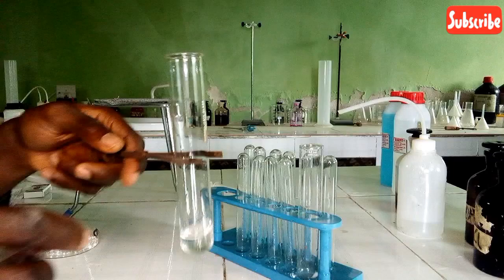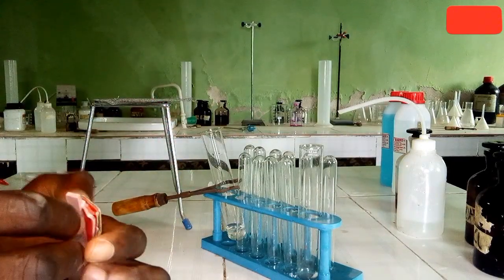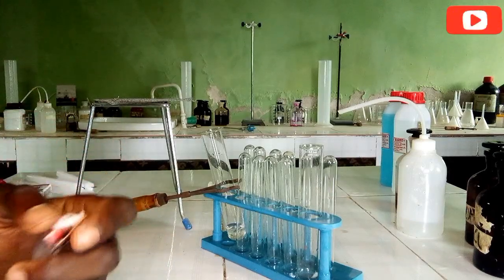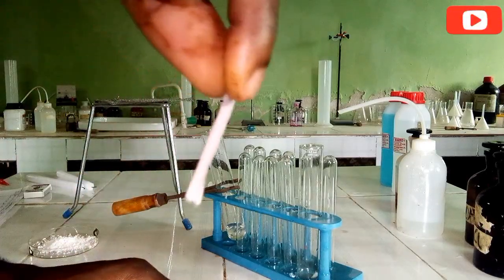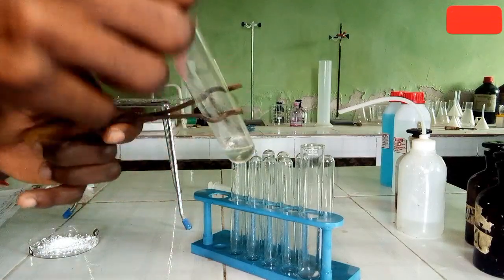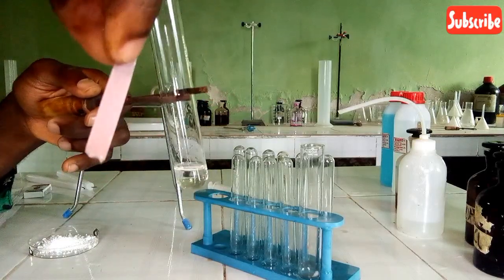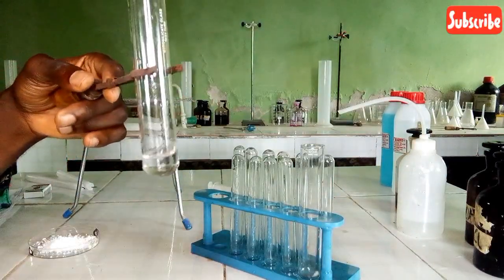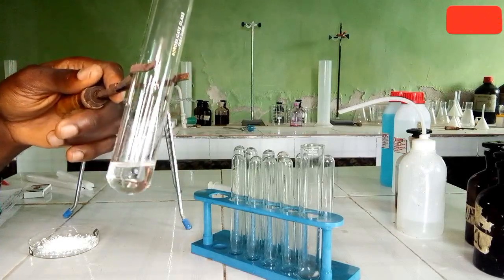So now let's check for red. Let's check for red to see if there will be any changes. So this is red litmus paper. Let's test the solution with it. As you can see, it still remains red and there is no change in the litmus paper. So that is the observation. Then the inference will be C is neutral. C is a neutral sample or salt. So that is the inference on that.